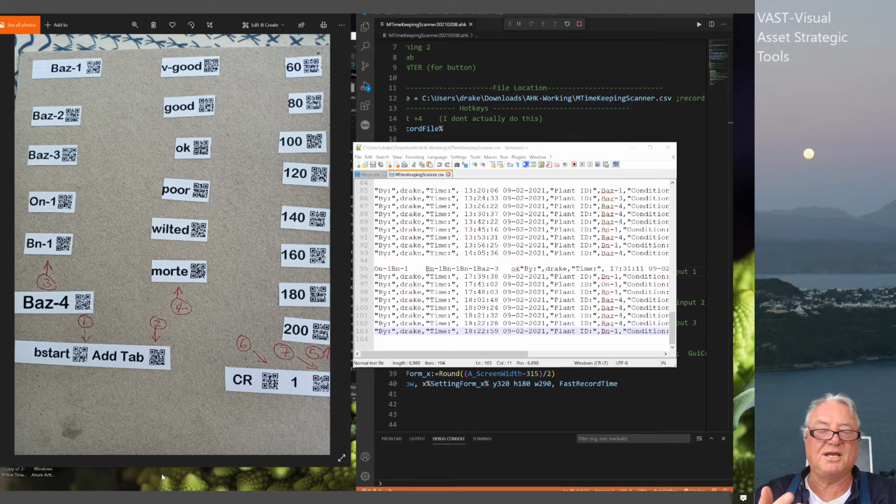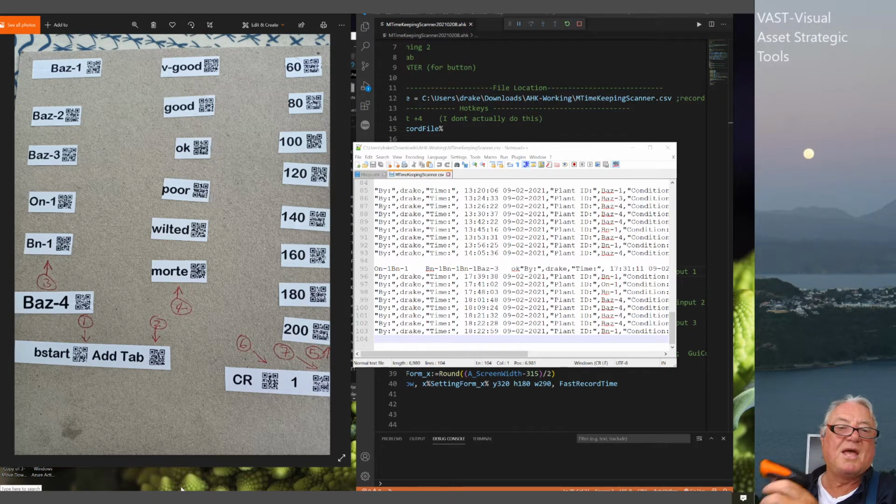So the intention was to use the barcode scanner to actually be able to start up an AutoHotKey script that would then, the initial intention was to open up something like Notepad++. Now if I have the mouse down here and I go and scan a barcode through here, the first beep beep beep is just that. Nothing happens. But if I come into here where it'll accept text, as soon as I scan something, you'll see that the data is coming through.